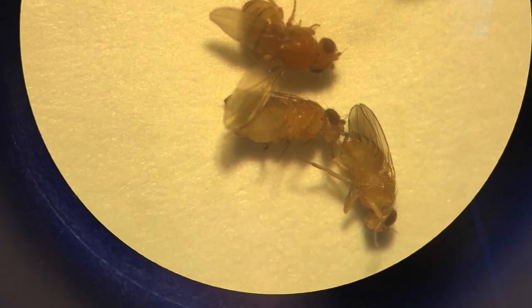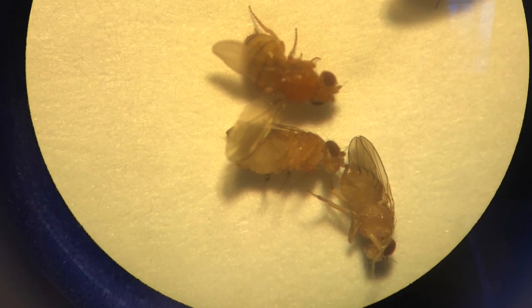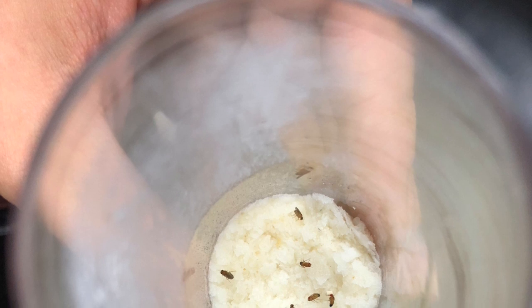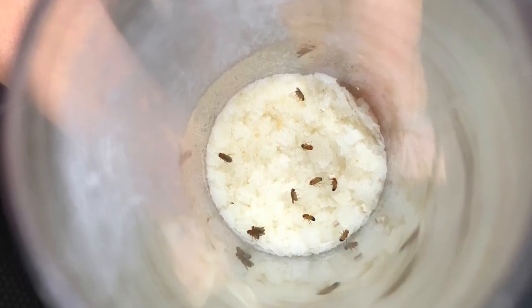The flies were observed under a dissection scope. Once observed, they were put in the same test tube as the media. To keep them in a large vial, a sponge cover was used to allow air in.